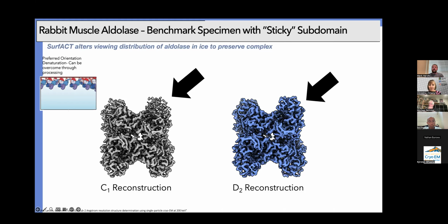So what we prefer to do is mix it at our 2x working concentration, and then we can leave it for a little bit as long as it doesn't oxidize or anything. That way everything's fully equilibrated. We don't have a big micelle population; we have basically every monomeric surfactant to hit the air-water interface.